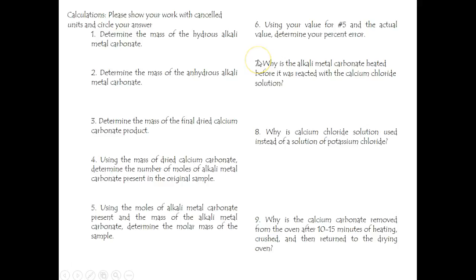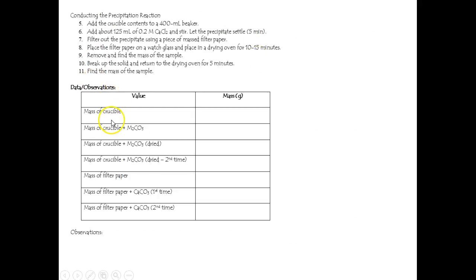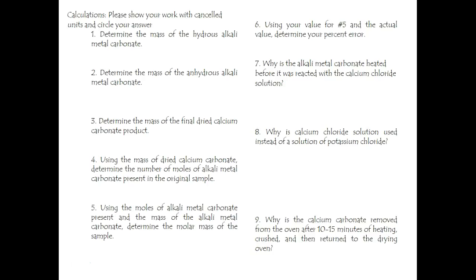Okay, and now we just fill in the data table, and this should be no problem. Some of this data is more important than others. Please mark down any observations that might help account for any errors that might crop up while you're doing this. We'll be using vacuum filtration to filter out the insoluble material, which takes place a lot quicker than other more time-consuming methods. And then you answer this series of questions and hand in your lab report.